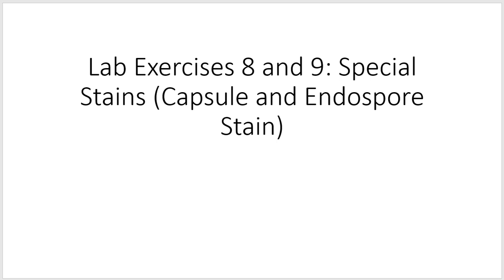In exercises 8 and 9 of your lab manual, we look at two special stains, which are stains that are done in very specific circumstances. We're going to look at the capsule stain in exercise 8 and the endospore stain in exercise 9.